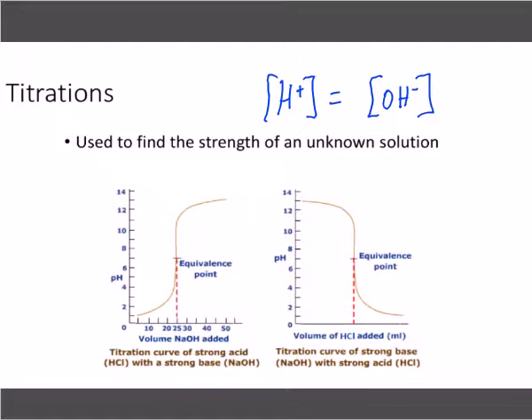What color were you really looking for, guys, with the titration? Barely pink, right? Because if you go past it to the endpoint, you're past the equivalence point where those two ions are equal. And notice how steep of a curve this is, guys. With your volume, if you add even just a hair, one drop, you can immediately go from like a pH of, say, 3 all the way up to a pH of 12. It's a very, very fine line.